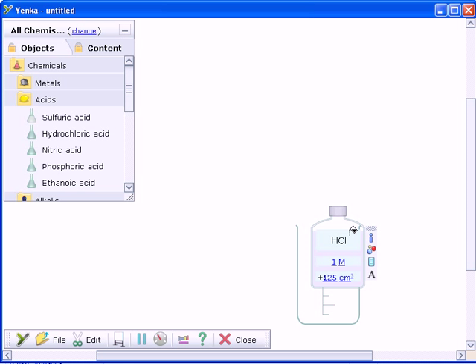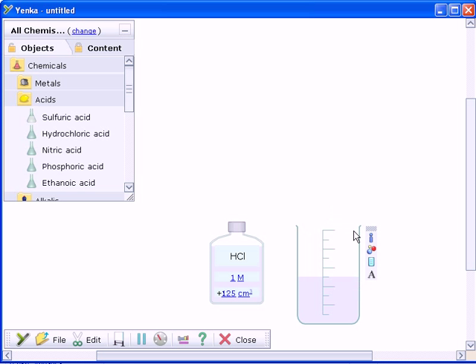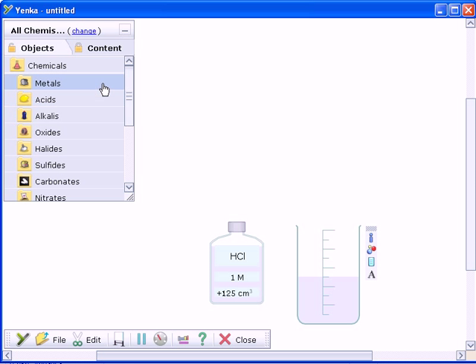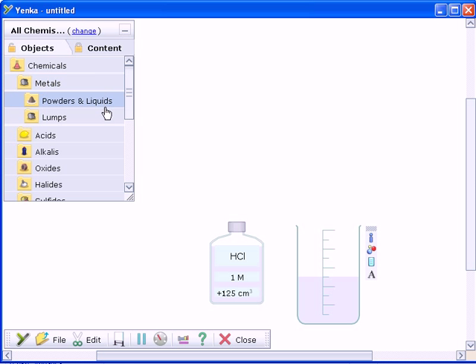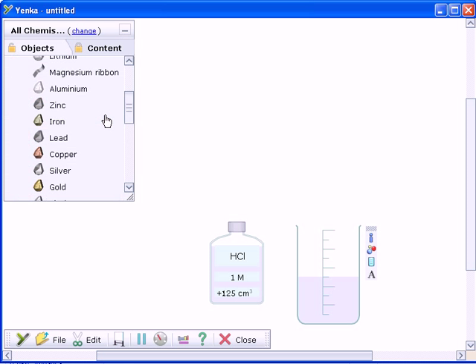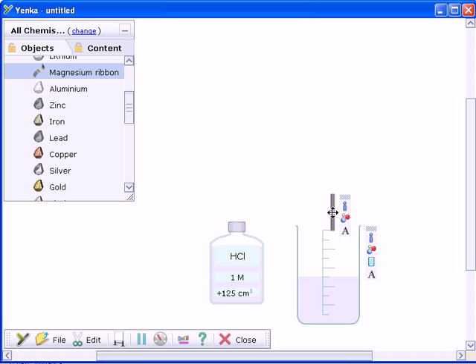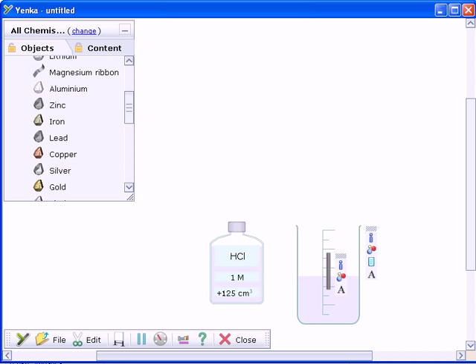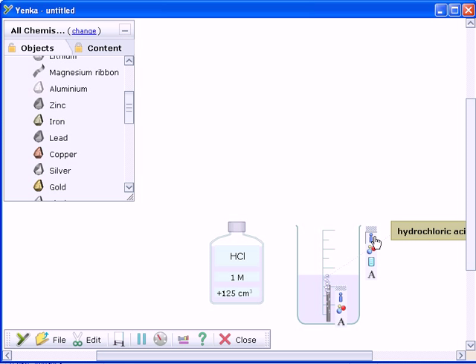Experiments are easily set up by dragging chemicals, equipment and glassware from the side toolbar. Chemicals can be combined as you wish, and reactions are modeled accurately as soon as you mix the chemicals.